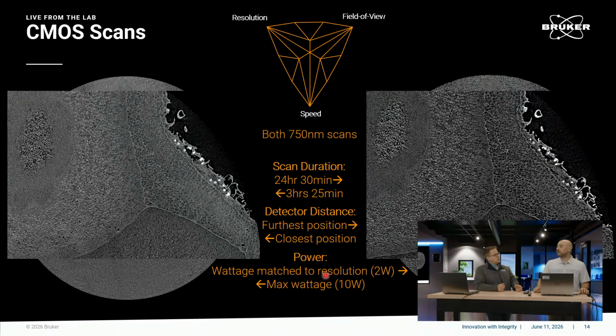It's awesome. What's important to understand is that not every time are you looking for that level of detail. Sometimes you want the medium level of detail. Sometimes you want to bring out a certain feature. You want a little better contrast, and you have the ability to do that.